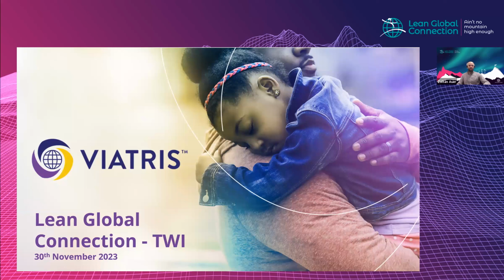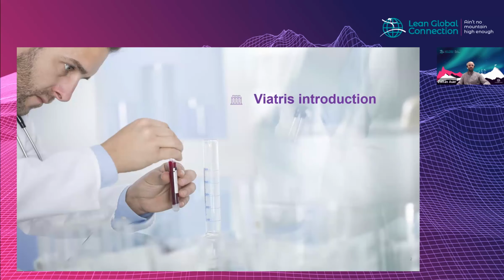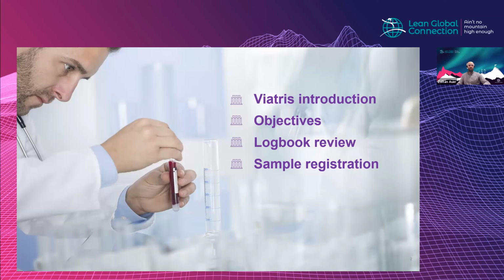The purpose of this section, as Csaba mentioned, is to demonstrate how we progressed from a common value stream mapping to reducing the number of errors through standard training in basic processes. I will start with a brief Viatris introduction. Then my colleague Oliver will share the original objectives and logbook review improvement. Then I will continue with the sample registration development and TWI methodology. And in the end, Oliver will share practical experiences related to the methodology and the outcomes.